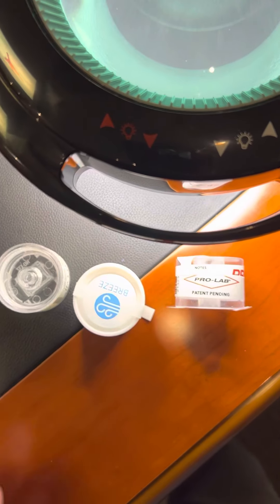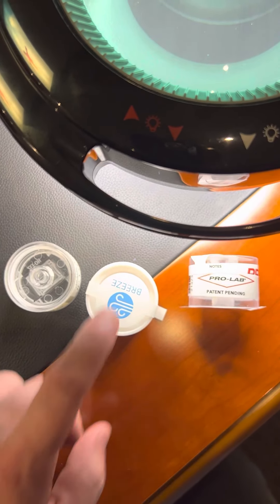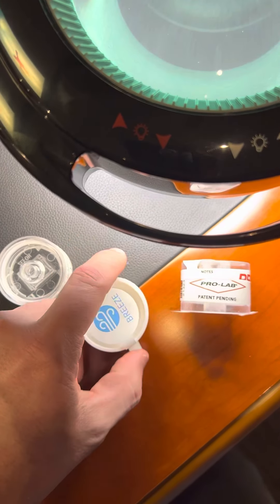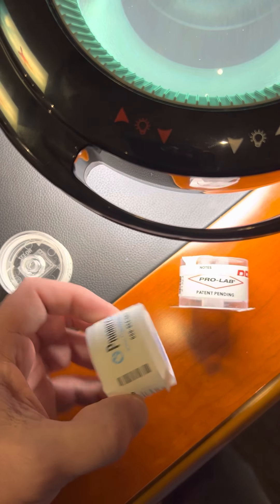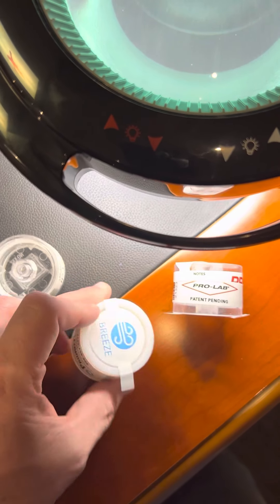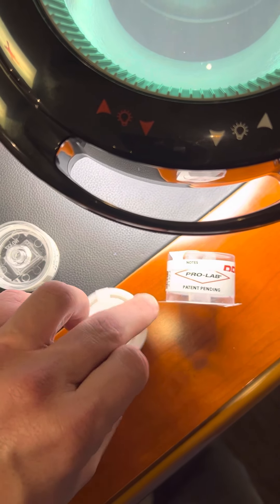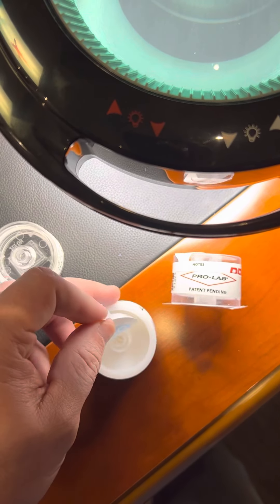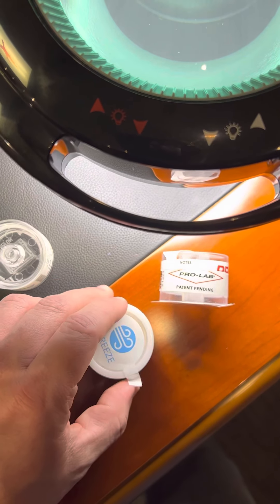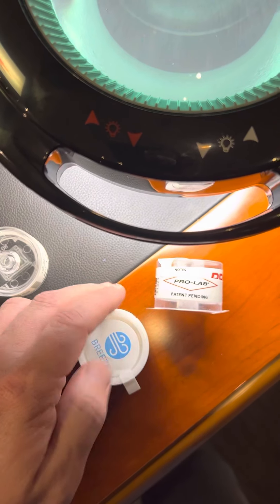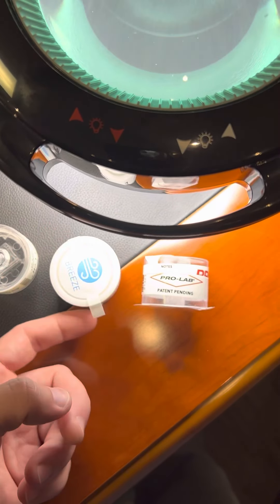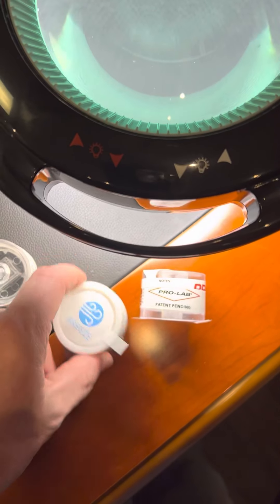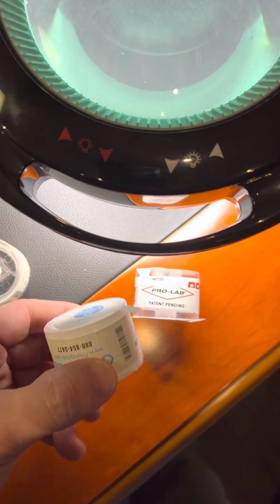You'll also see on the label there's a serial bar. And that serial bar is scanned directly into your mobile app from Priority Lab, which makes it so you don't have to write down any numbers. This unit has some cool features. The sticker, for instance, is super easy to take off for when you attach it to the pump and then reattach it. So cool stuff there, not sticky at the end of this and cheaper.